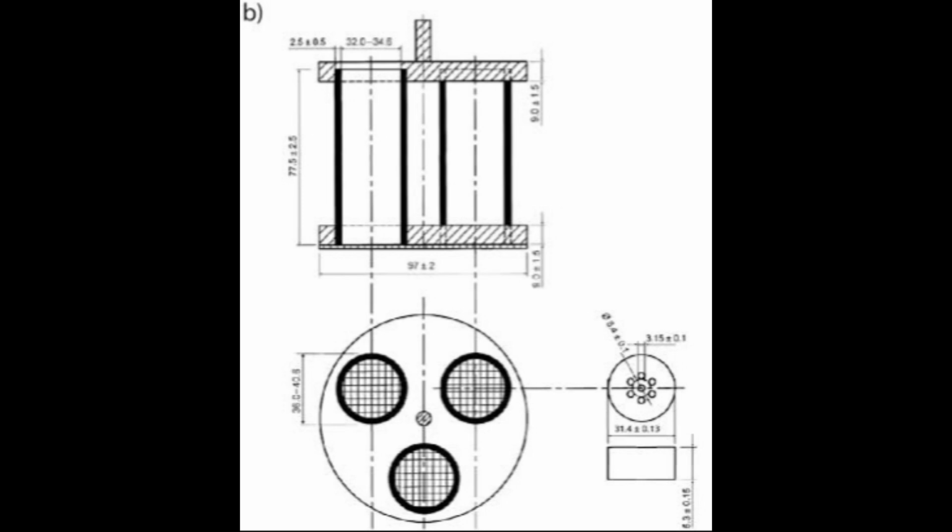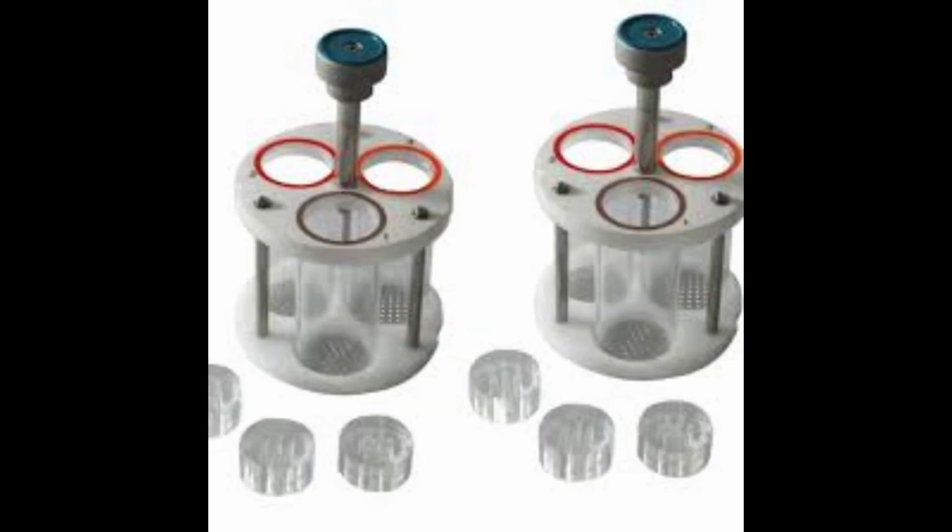2. Underlying principle. Disintegration testing simulates the mechanical and fluid penetration forces a tablet or capsule encounters in the gastrointestinal tract. It measures the time required for a dosage form to break into granules small enough to pass through a defined mesh, 2 millimeters.